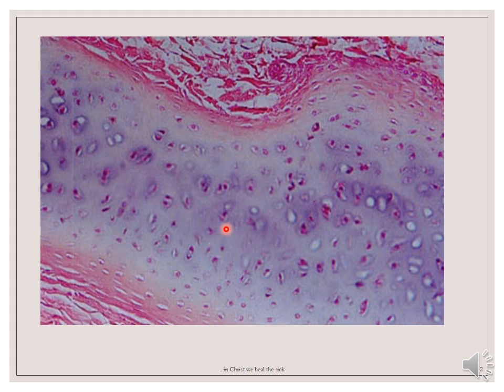These chondrocytes are contained in a cavity in the matrix. As you can see here, these are cavities that are not even filled with cells, but in this one you can see a space which represents the cavity. These cavities are called cartilage lacunae, which are actually artificial gaps formed by the shrinkage of the cells during tissue preparation.